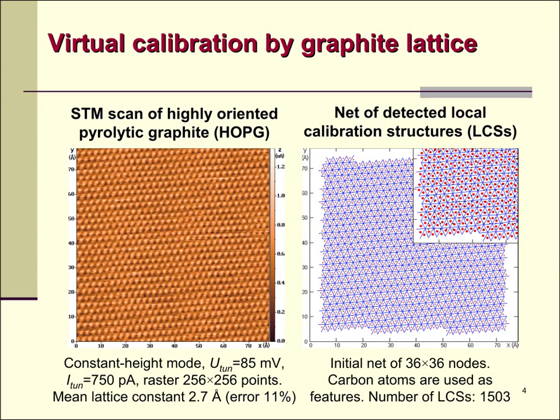The left side of the slide shows an STM image of the atomic surface of highly oriented pyrolytic graphite used as a length standard. The image is distorted by thermal drift and creep, which causes an 11% mean relative error of measurement of the crystal lattice constant. On the right, shown is a net of local calibration structures detected during the virtue of distributed calibration.